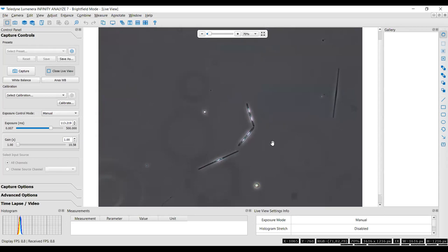And this is one. So this would be a natural unit of one with cells of two because they are in fact attached. And then this would be a natural unit of one and a cell of one. That would be nothing because it has no cell contents. So that one is not living.